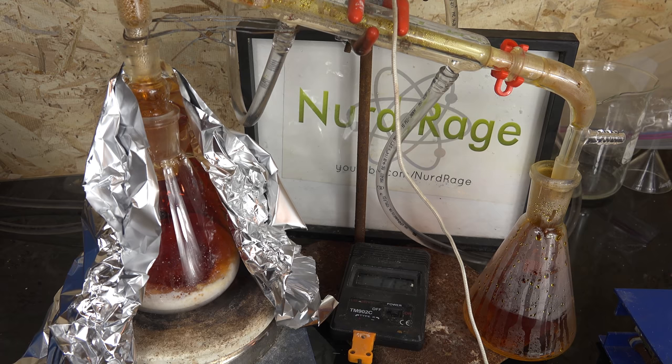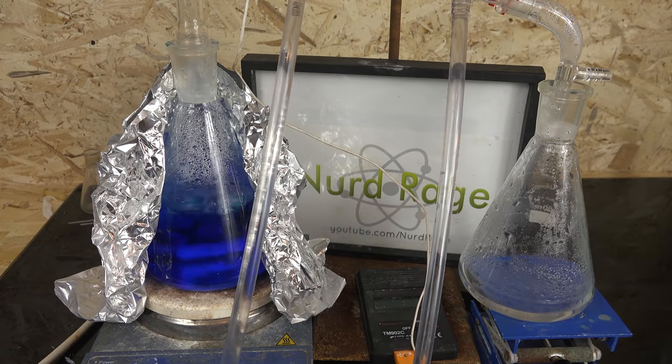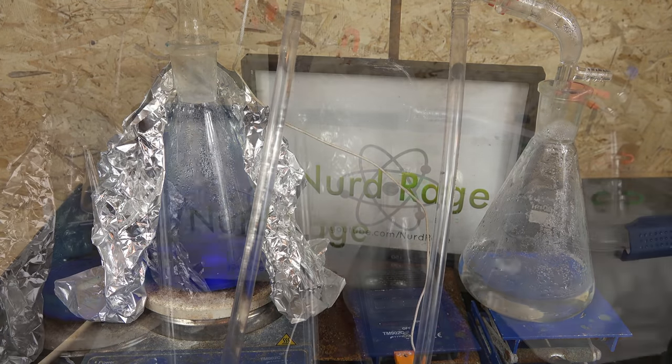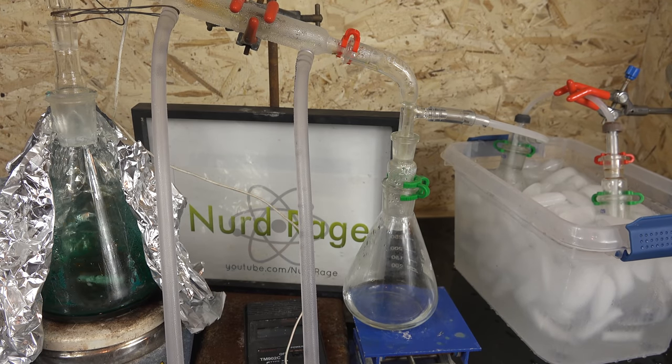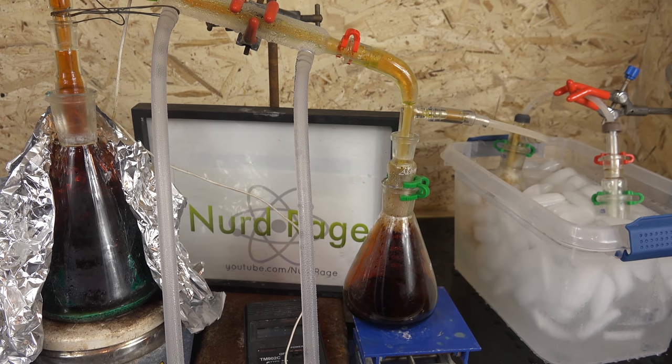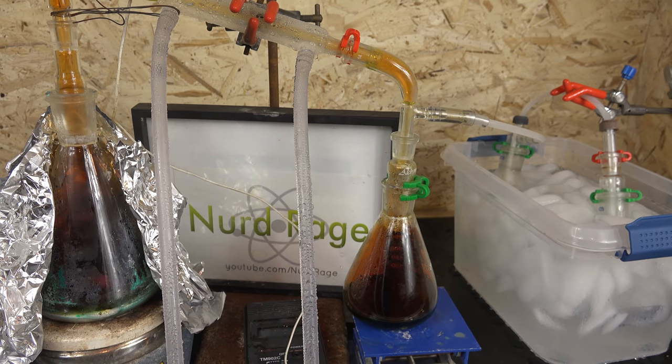In this video we're going to try and make nitric acid without using any other starting acids at all. To do that we're going to use a very interesting chemical: copper nitrate. Copper nitrate decomposes with moderate heating to form copious amounts of nitrogen dioxide and oxygen. If these are bubbled into water then this can be used to make nitric acid without using any other acid. And that's it, it's that simple.